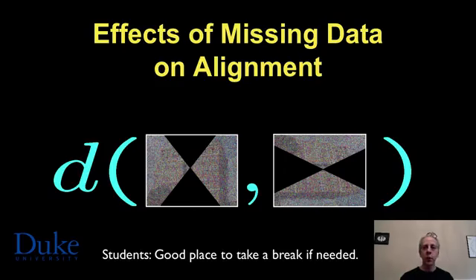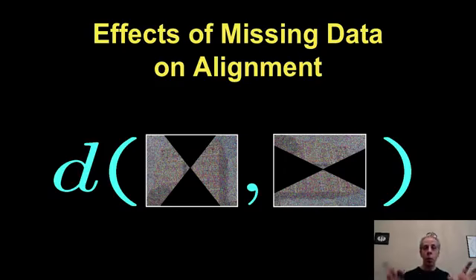The first thing we have to do is define a distance. Remember, we want to align these projections or these three-dimensional shapes, but with missing information, with the missing wedge and with noise. So how do I design, going back to the images in 2D projections of the buildings, when these two are aligned or not aligned? I need to basically define a distance. We take any two images, two projections or 3 dimensions, depending where we are working, and how do I know if these two are aligned or not? That's the first thing we need to do, to define a distance.